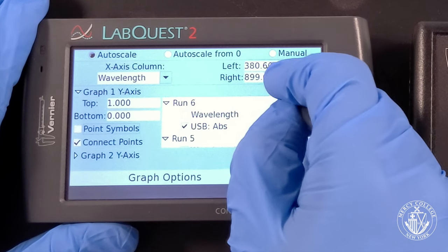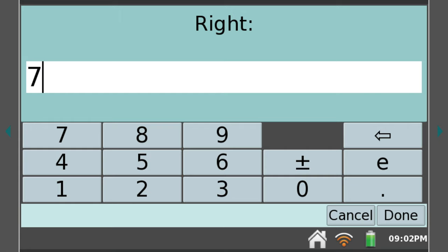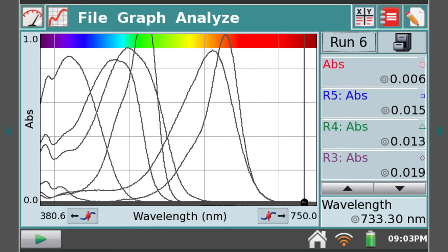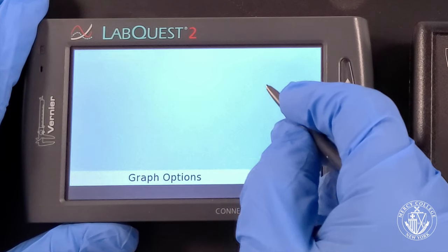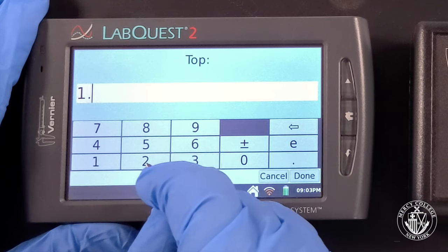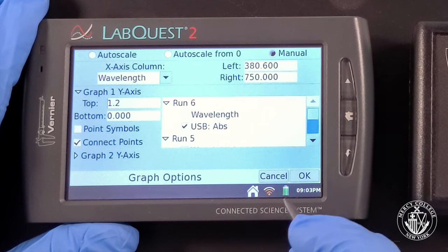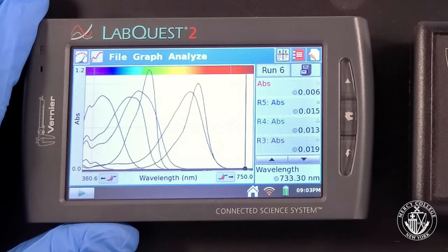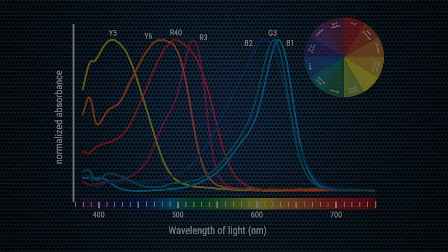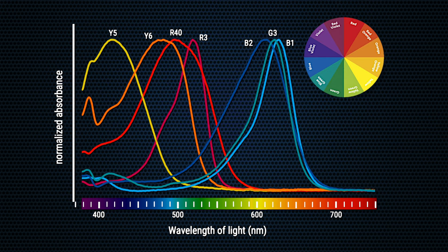We may also wish to change the x-axis of our plot. 899 nanometers is pretty far into the infrared, so we're going to shorten that to about 750 nanometers at the end of the red range. If some of your peaks are cut off, we can also adjust the y-range of our plot. Select the Top option and change the value to something more like 1.2. Now we can see how each of our dyes has a unique and almost fingerprint-like absorption spectrum. We can use those features to identify each of the dyes as well as using the peak positions to pick out colors that might be present even in a mixture.